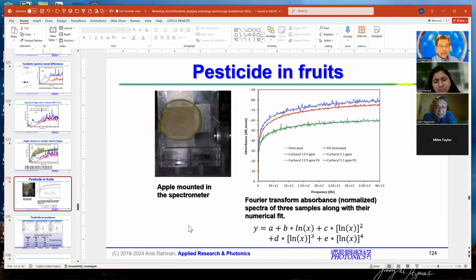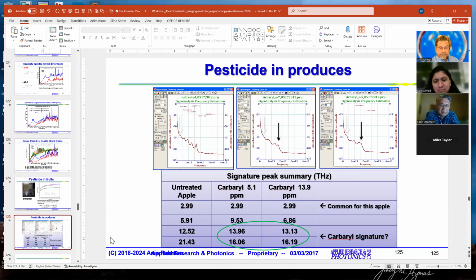And so it was not heated or anything. There is a particular area where the carbaryl solution was applied. There must be some source of error there, but within the experimental error limit, this is what we were able to do.